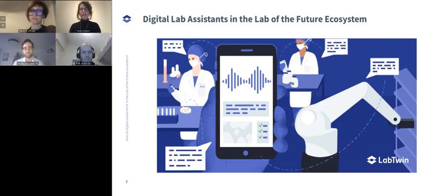Thanks. Very practical advice. So I have my second question, which starts with a comment and then moves towards a question, so bear with me. Adding context sounds good. In practice, this means adding some metadata, but we have had big issues with standardizing metadata use across researchers, not to mention research teams. The problem is we don't really know what type of metadata will be useful and what is just clutter. Could you comment on what type of metadata could be useful with a digital lab assistant?